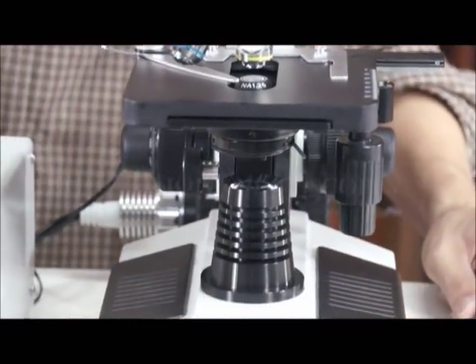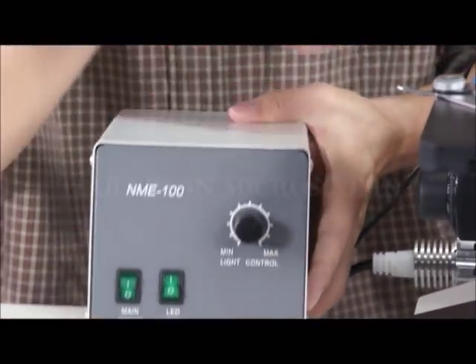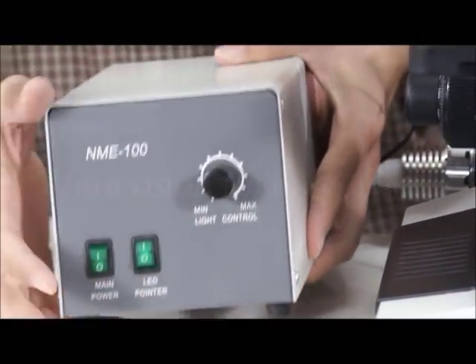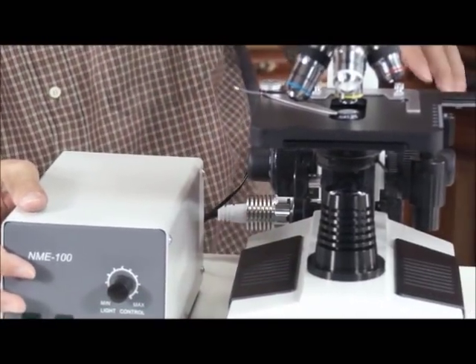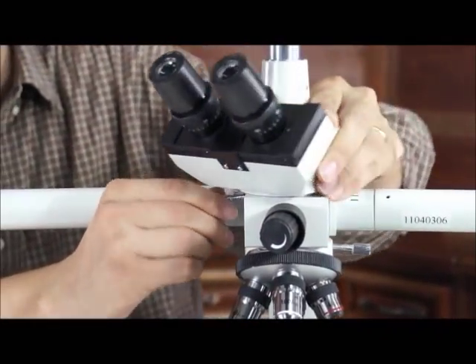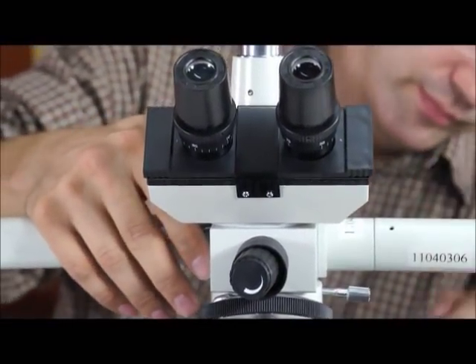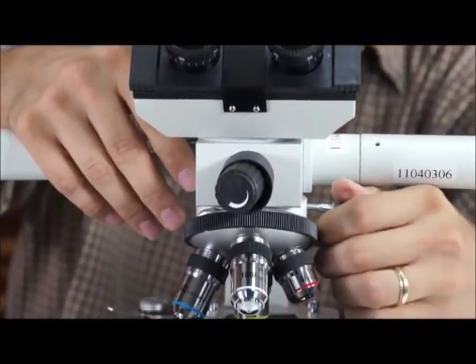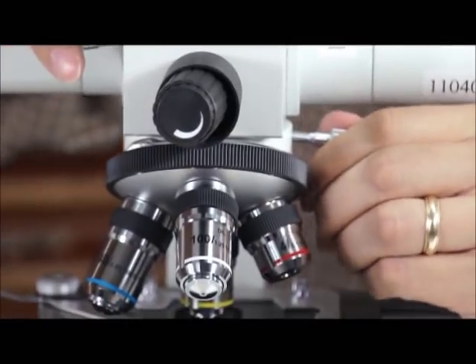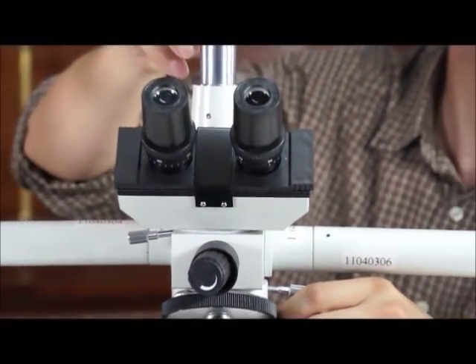You have the light intensity knob. This is for both the pointer and the halogen light that illuminates the image. You have the ability to turn the heads in any direction. This is the top trinocular port for photography, camera, and video systems.